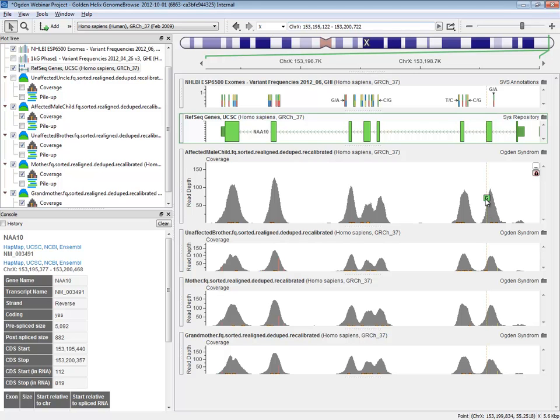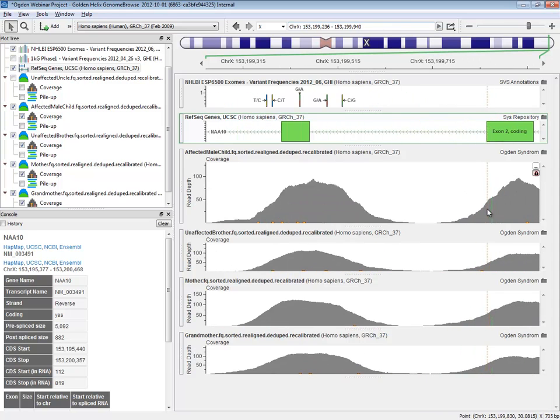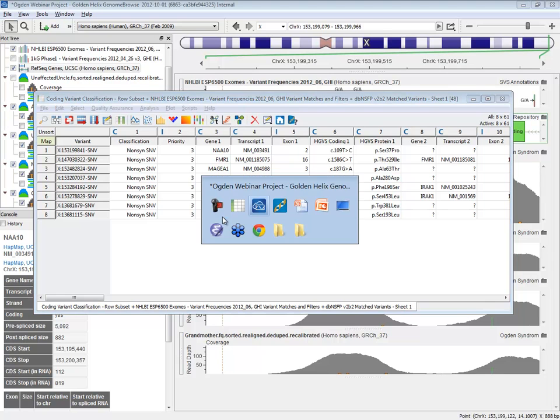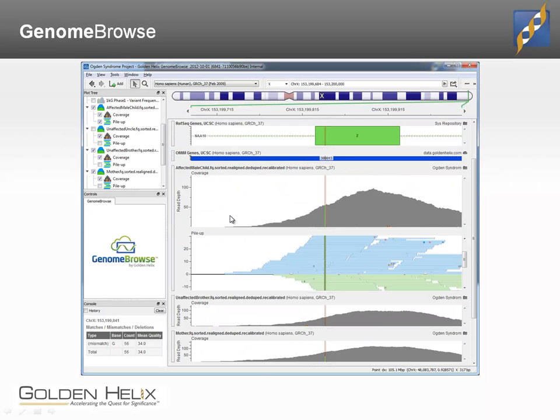And in fact, Sanger showed it to be true, but to the point where you have this many reads supporting it, Sanger sequencing, I think, is eventually going to be antiquated, or at least not necessary unless you are less confident. So let's go ahead and wrap up our presentation here.